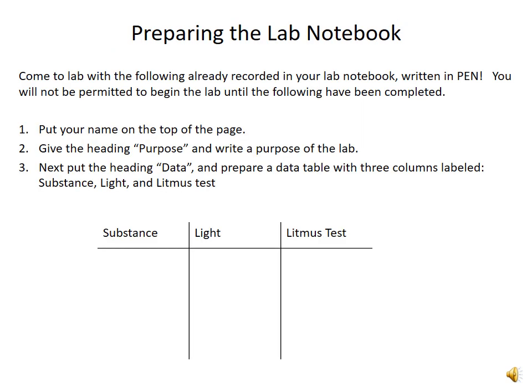So now that you have some general sense of what the laboratory procedure will look like, you want to reflect that in your laboratory notebook before you come to lab so that you're ready to get started when you arrive. So I'm going to check everybody's notebook to make sure you've both written in pen and that you've completed this short assignment before you get started, so that I'm sure that you're prepared to begin.